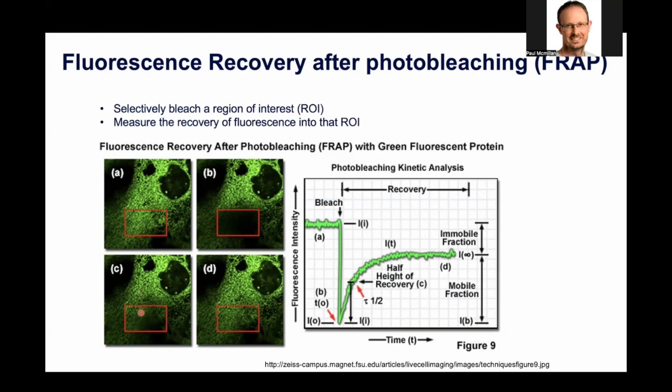So what we're looking at is mobility of those molecules within your sample. If we look at the figure here on the right-hand side, my mouse is being very glitchy.